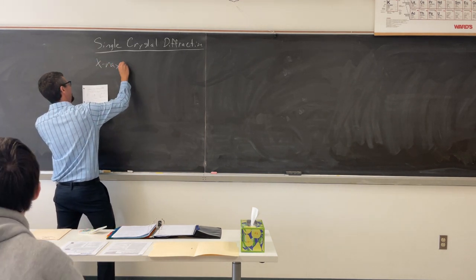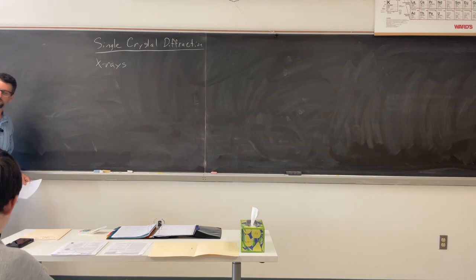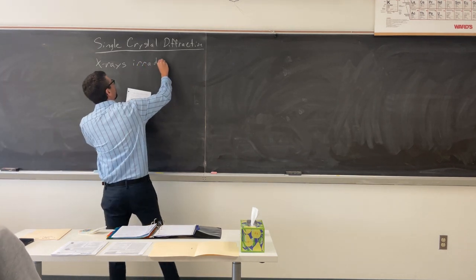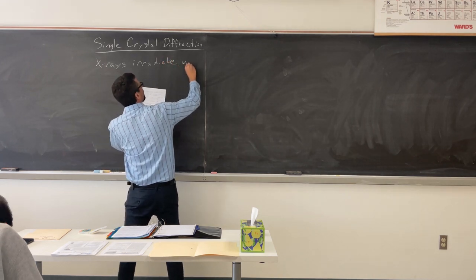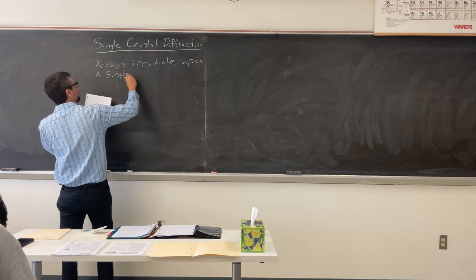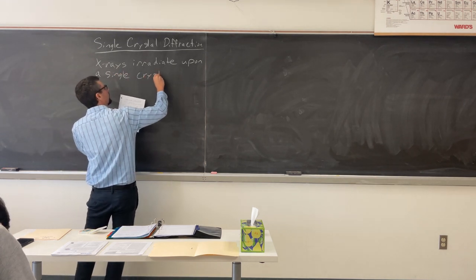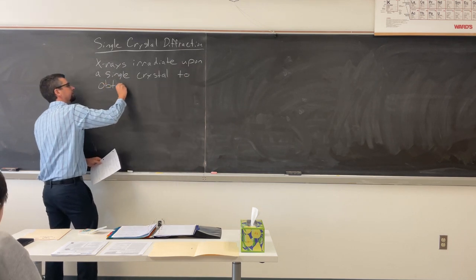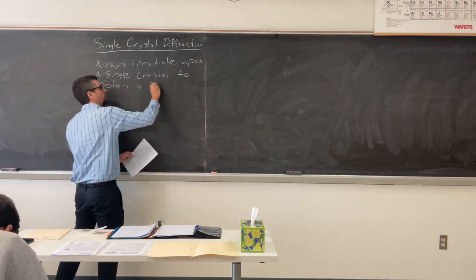All right. So we use X-rays. We irradiate what? A single crystal to obtain a 3D structure.